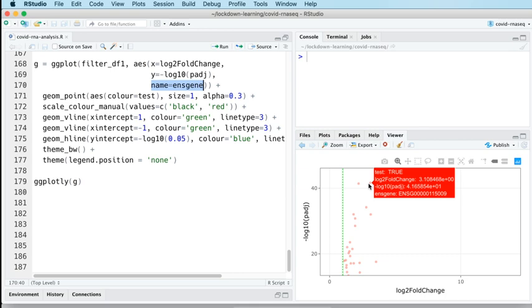The limitation of that at the moment is that Ensembl gene IDs, while they are very useful as identifiers because they're unambiguous identifiers, they uniquely identify one gene, and they can be used in lots of ways, they're certainly not human readable.